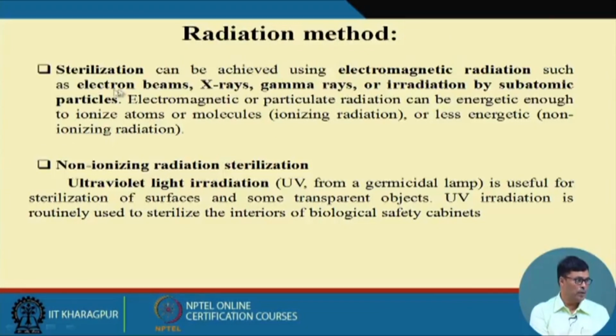Now sterilization by radiation can be achieved by electromagnetic radiation such as electron beam, X-ray, gamma rays, or radiation of subatomic particles. Electromagnetic or particulate radiation can be energetic enough to ionize the atom or molecule, or less energetic. Non-ionizing radiation like UV rays is useful to sterilize surfaces and some transparent objects.